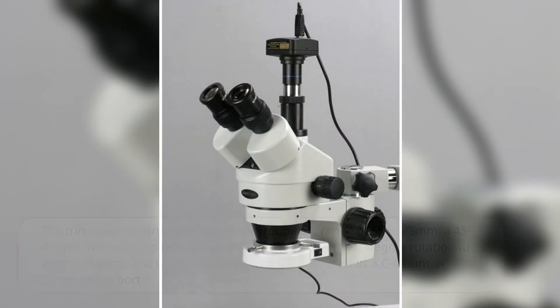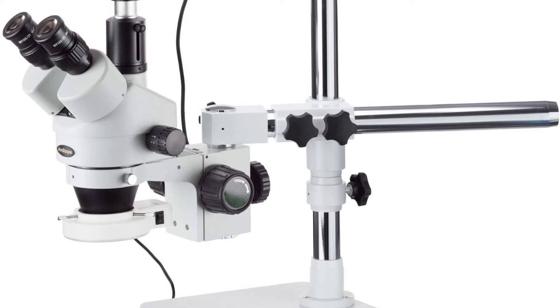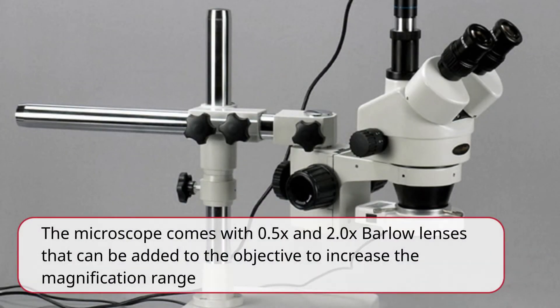The trinocular viewing head has an interpupillary range of 55–75mm, a 45-degree inclination to reduce eye and neck strain, and 360-degree rotation to enable sharing. The vertical trinocular port can be used as a C-mount or 23mm photo port. The WH-10x 20mm super wide-field high-point eyepieces combine with a 0.7x–4.5x zoom objective to provide continuous zoom magnification and a longer working distance for inspecting large-scale specimens that require handling or repair. The microscope comes with 0.5x and 2.0x Barlow lenses that can be added to the objective to increase the magnification range.